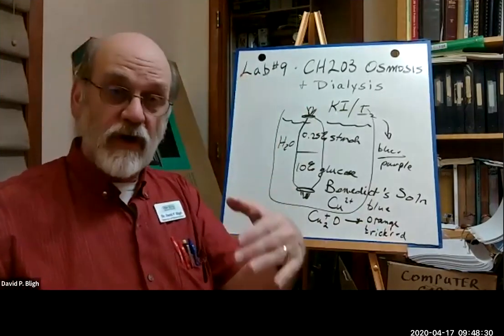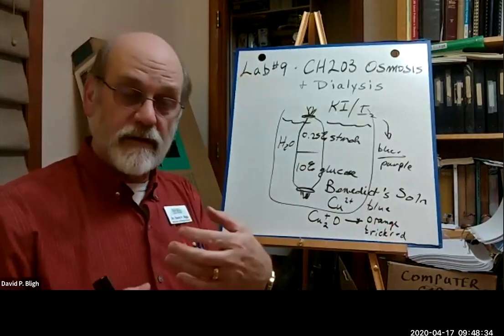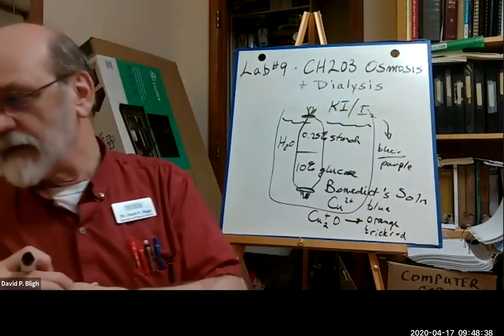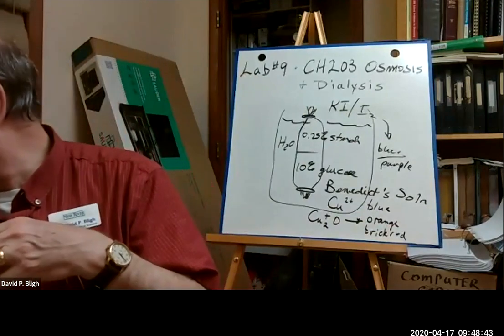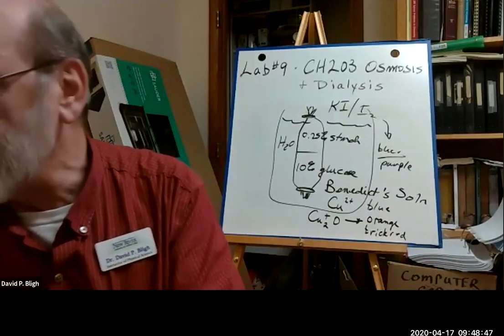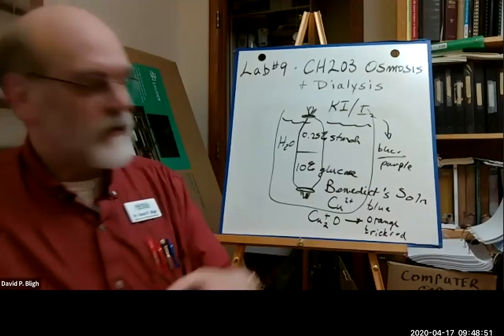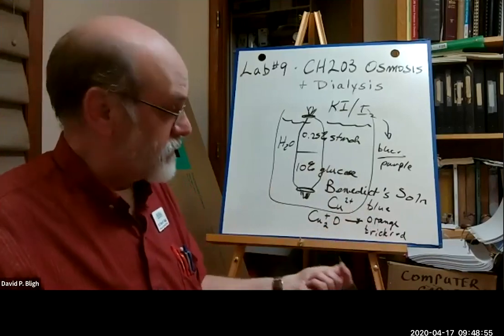And the range of color gives you a semi-quantitative indicator of concentration. Right? So if it's very low concentration, it should be maybe even only green. It goes from blue to green, to yellow, to orange, and then to red if it's a very high concentration.